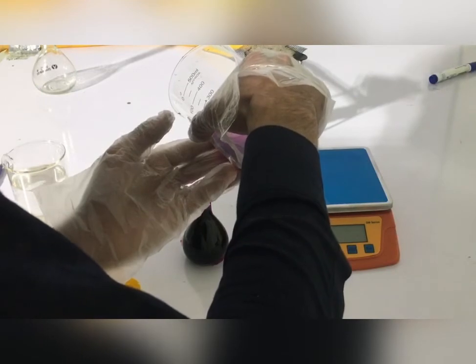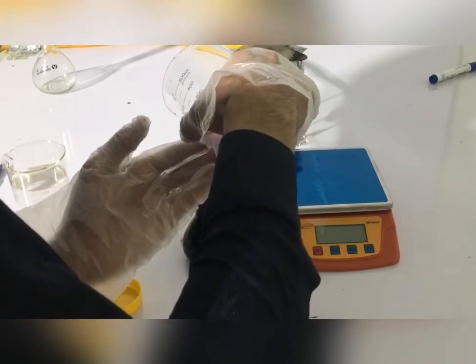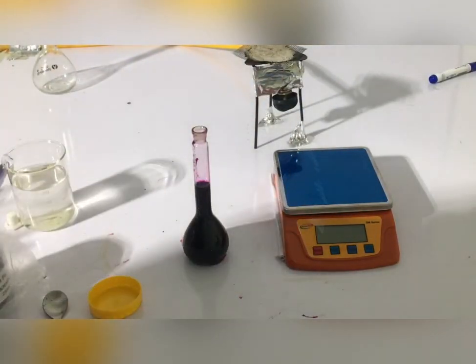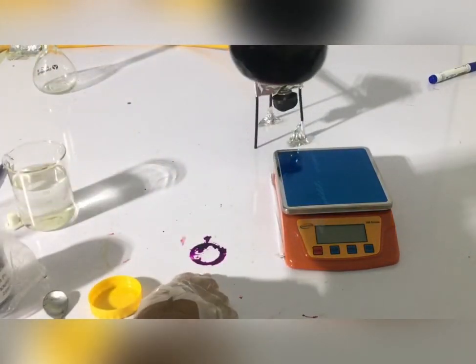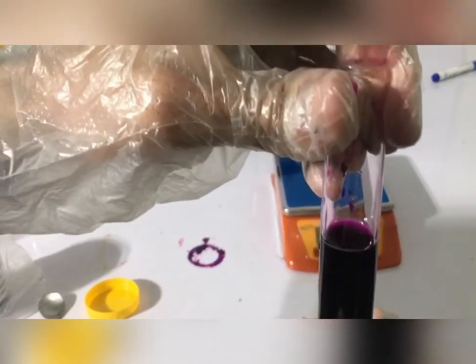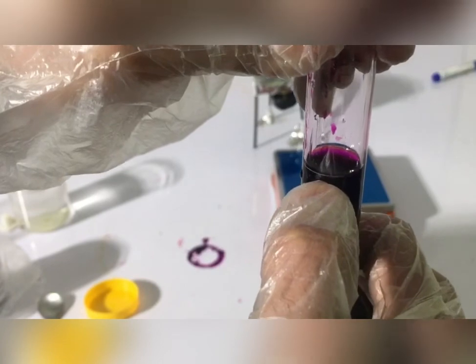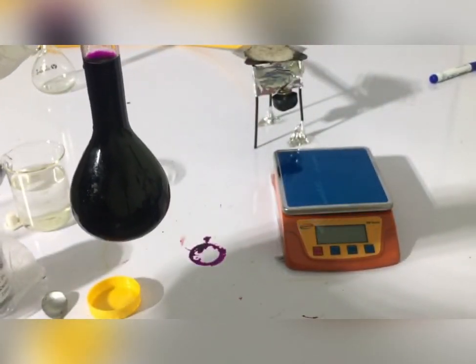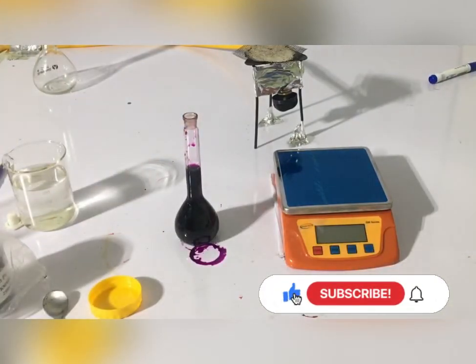I need additional water for the second time. Now I will add to the mark. The amount is the last one. The mark is installed. This is the 1.6 gram design. This is the 100 ml mass solution. This is the solution preparation.